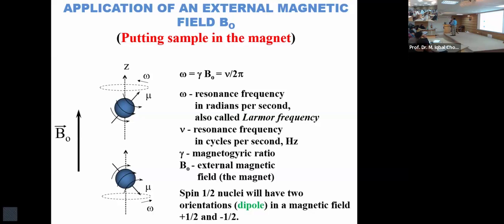Capillary. Yeah, so about 60 years ago, when Dr. Atia was learning NMR, people used to use tetramethylsilane because there was a need for a reference which was zero, and then everything was measured with reference to TMS.